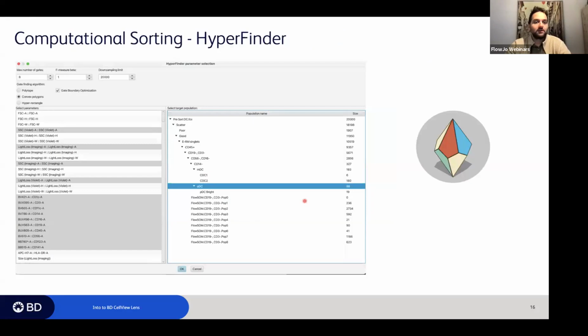No problem. And then let's say now we identified the population, we made an image set and found all the similar images to the one, the morphology we're interested in. But we now don't know how to exactly sort that population, because this step involves some manual selection of images. When we created the image set, we selected morphologies manually. So there are two options.